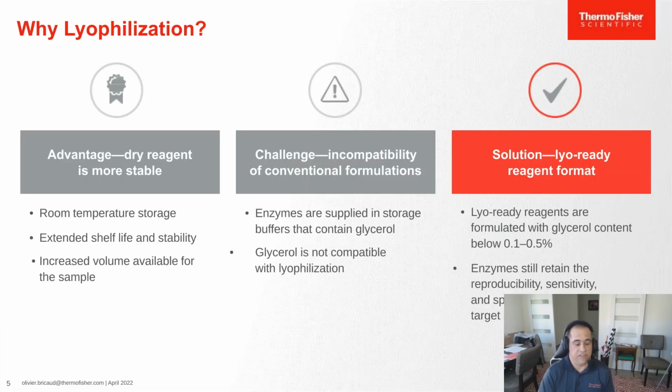So why lyophilization? Besides what I just said, first of all, it's much more stable than any other preservation method. It can be stored at room temperature, which extends the shelf life and stability. That also increases the volume that's available for the sample, because we don't need any kind of preservative; it's just the sample itself and the reagent itself.